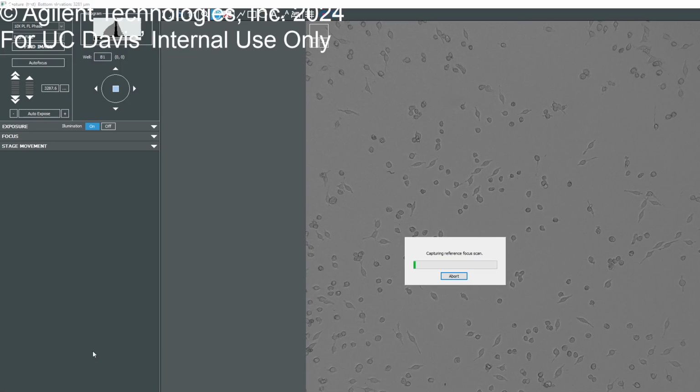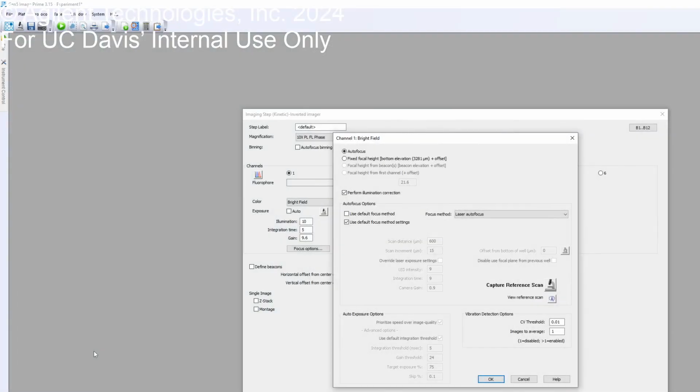So for the kinetic readings, can you see a trace from an individual cell in terms of whatever metric you're measuring from it, like how it changes over time? Yep. So there is also a cell tracking module that's an add-on for that. But you still get like the cell level, object level details, but that's not going to be aligned. Like if there's like cell number 1 in one image, that may not be a cell number 1 in the other one. Oh, okay. But if you buy the tracking module, then it will keep track of that. They're like separate modules.